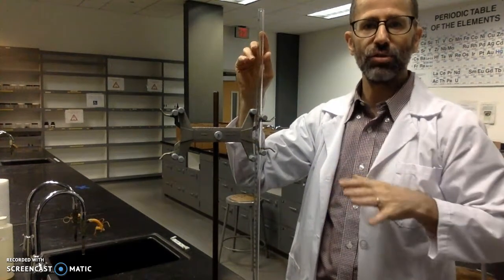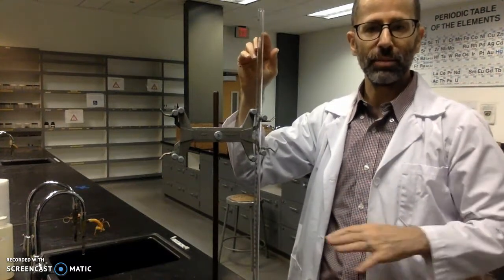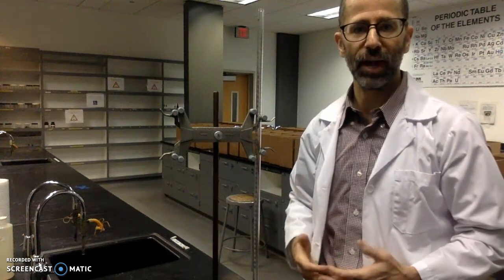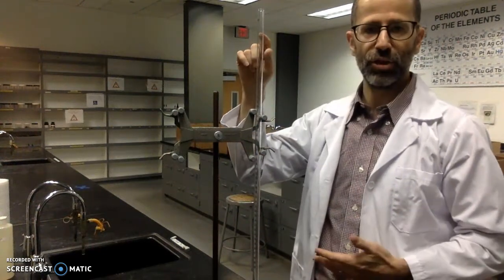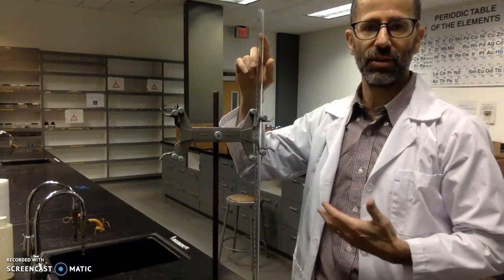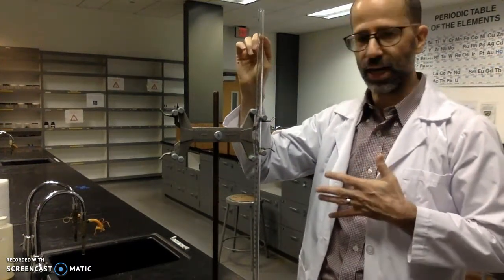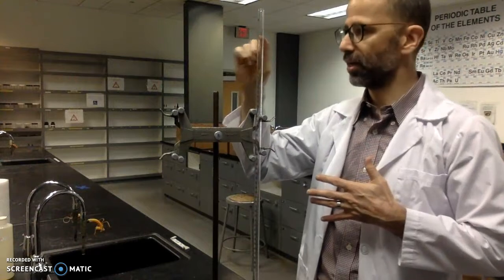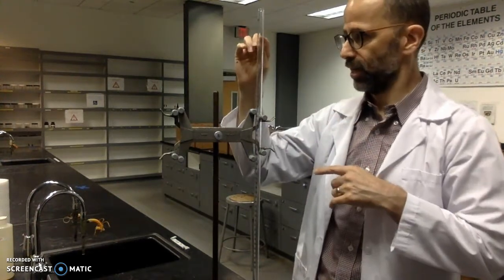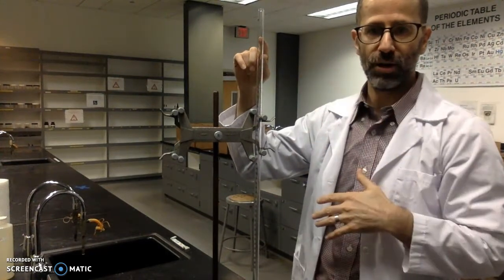And it's okay if it goes below zero. You don't have to measure your initial volume at 0. As a matter of fact, I would encourage you not to, because I want you to get in the habit of just measuring your initial volume wherever it is, because that's the thing with burettes: as long as you are being precise with your measurement, then you can measure it anywhere. It doesn't matter if it's 0. It could be below 0. Whatever the initial volume is, just measure it where it is.